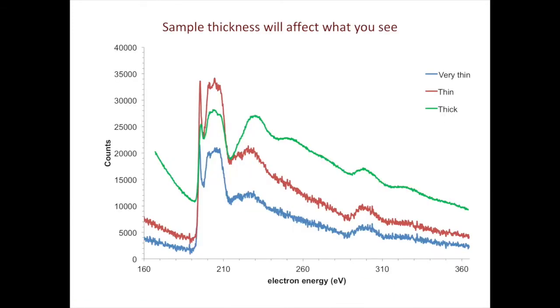After background removal, we need to look into the plural scattering deconvolution. Coming back to our original example, where we have the same grain but different thickness values. If you look at the region shaded in blue, the thinnest sample has a very small hump. As the sample gets thicker and thicker, the hump becomes more and more prominent.